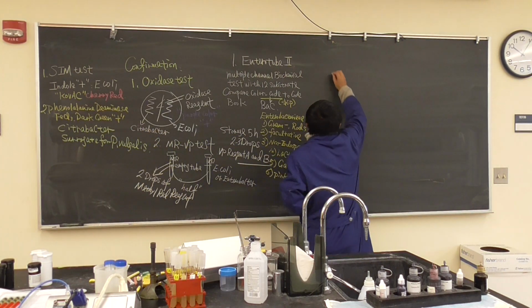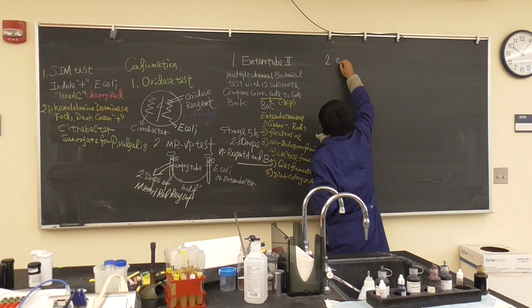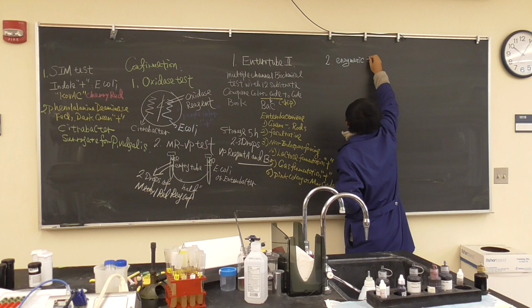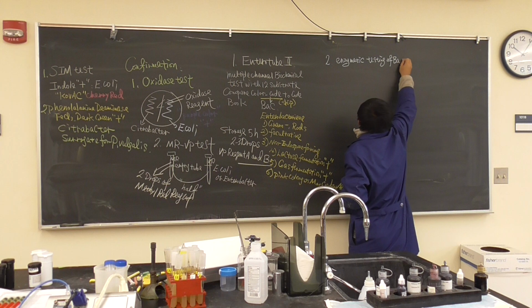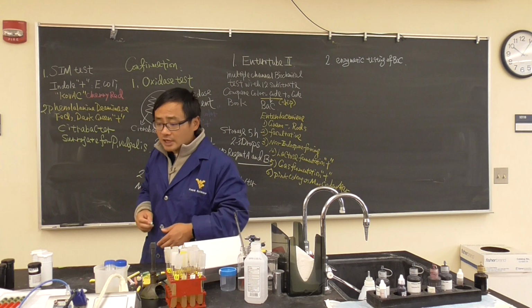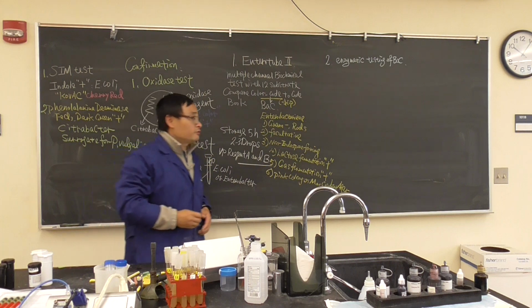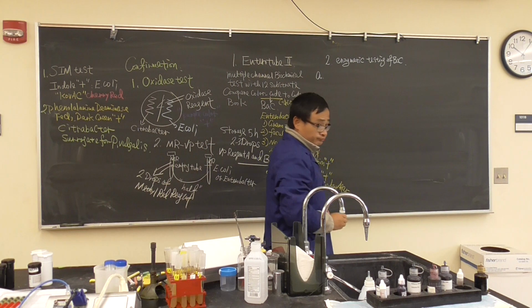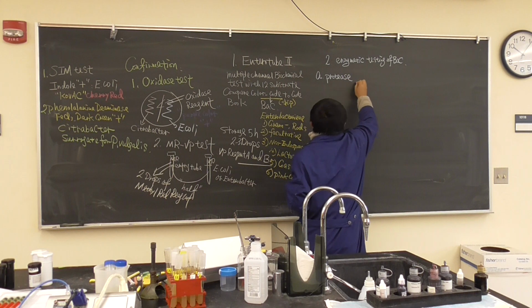Second one, we will be doing some enzymatic testing of bacteria. So what this means, bacteria have an enzyme, and sometimes can use other energy resources other than glucose. So for example, they could use protein if they have protease. So how do we do it?